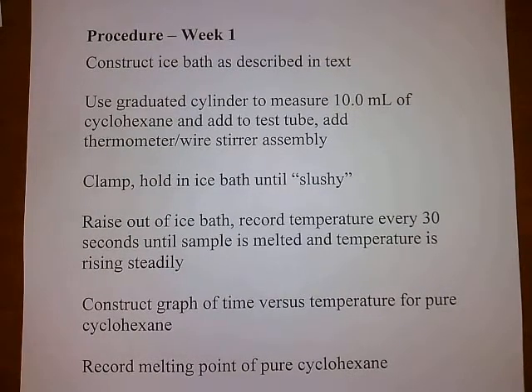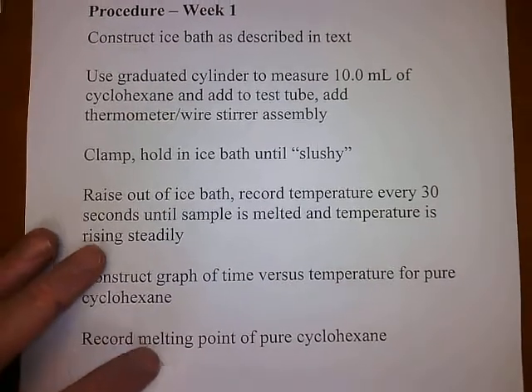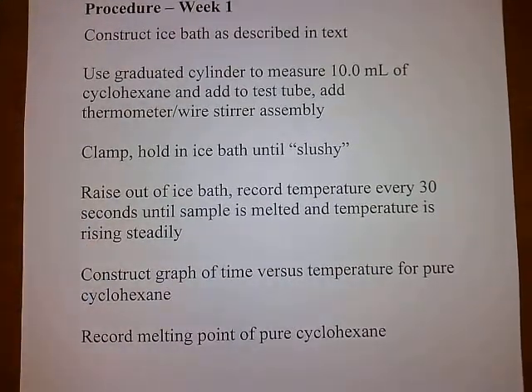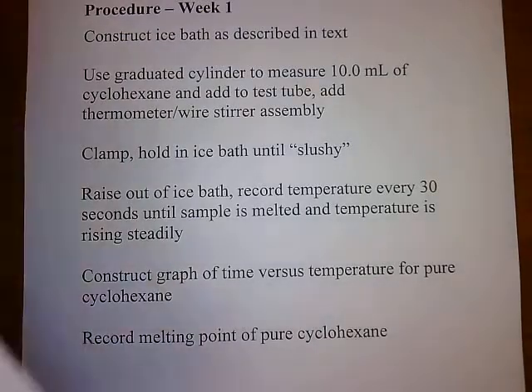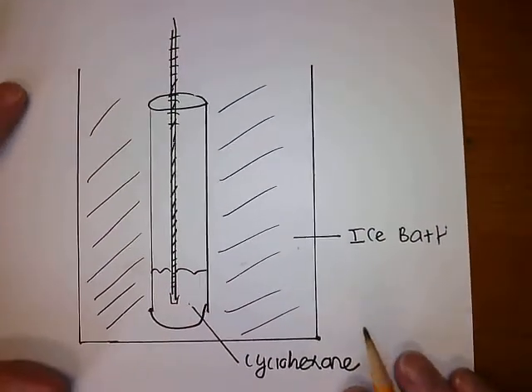You'll construct a graph of time versus temperature for pure cyclohexane, and you'll record the melting point of the pure cyclohexane from your data.